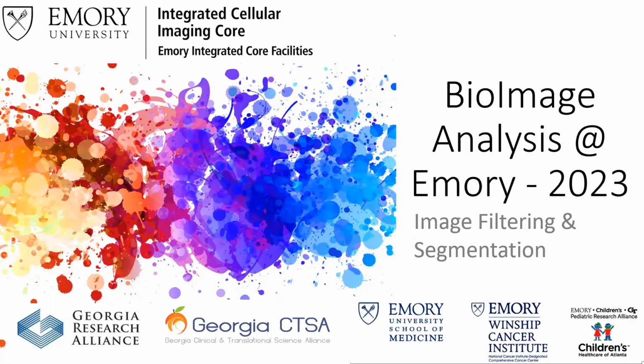Today we will cover more about segmentation. We touched base with it yesterday, but we're going to cover it more in depth here, and we're going to touch on image filtering. And this filtering is going to be useful both on the raw data images and sometimes on a post-segmented image. We'll see in instances where there's still a little noise remaining as well.